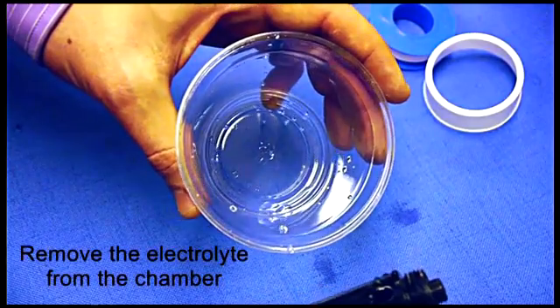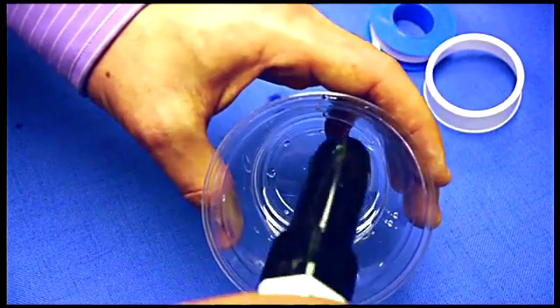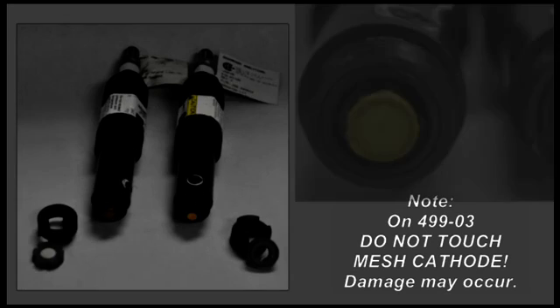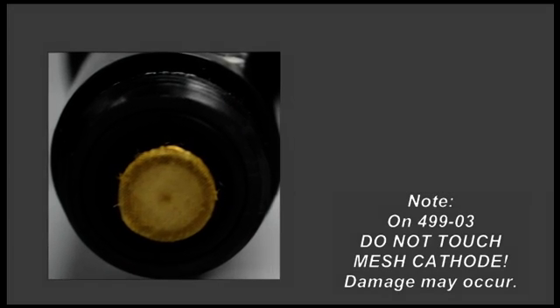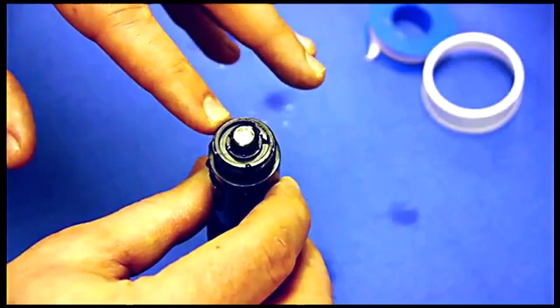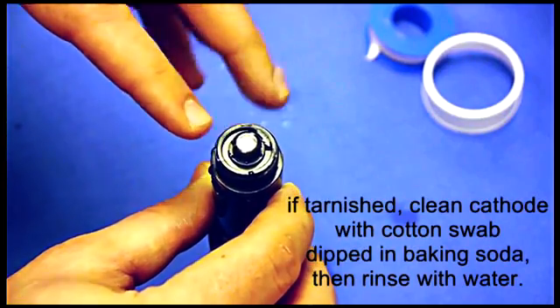Then you want to dump out the excess amount of electrolyte solution that's still in the sensor. Then you need to inspect the cathode. If it's tarnished you just need to clean it with a cotton tip swab dipped in baking soda and clean it off.